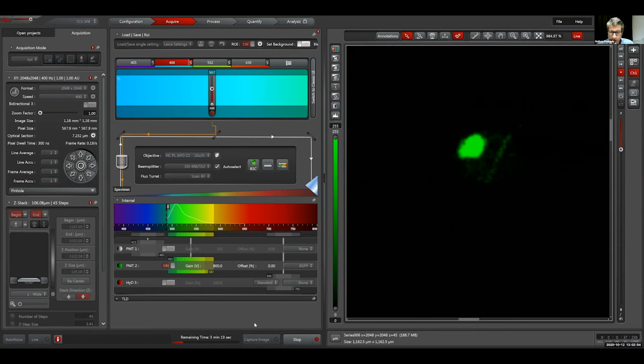So this is being recorded, but write down what we did because this is an experiment. How do you bleach something, and what is the effect of trying to bleach GFP in an insect brain that we have? Later, we are going to do it with DAPI, but write down what we did. We just did one cell with 3 passes at 50%. And we didn't finish the Z stack because we didn't care about the picture.